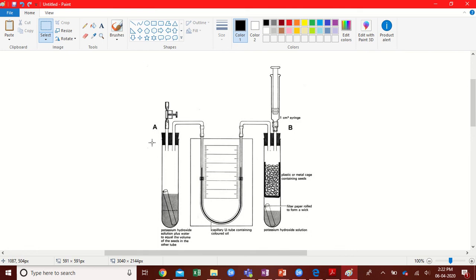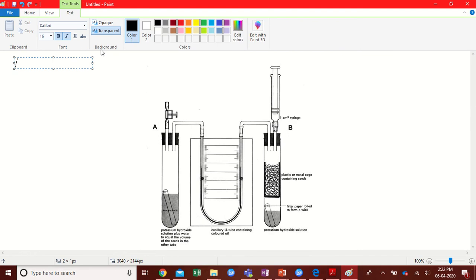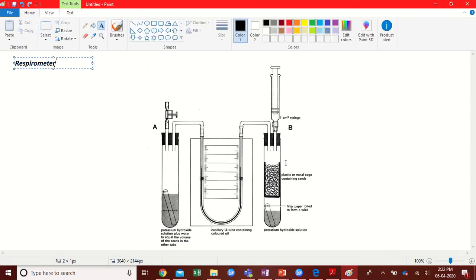Okay, so one way to measure the rate of respiration is by using something called a respirometer, which is this apparatus we see in front of us here. Now, the respirometer has three main components. It's going to have a boiling tube on this side here where it says B, another boiling tube where it says A.